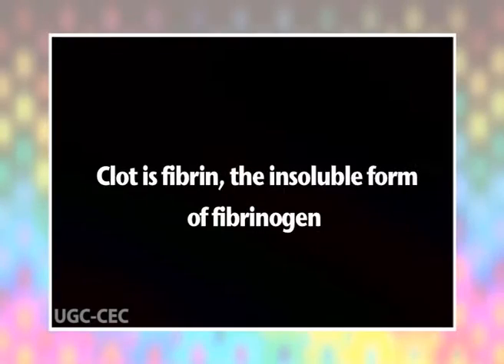After incubation, insert a tapered glass rod into the solution and feel the transparent clot formed and collect it by pressing against the walls of the beaker. The clot is fibrin, the insoluble form of fibrinogen.